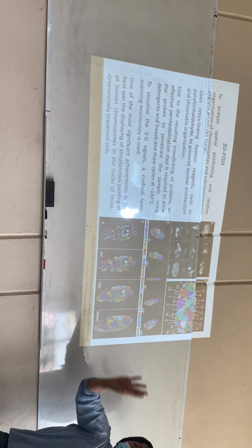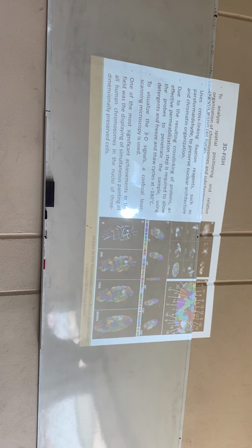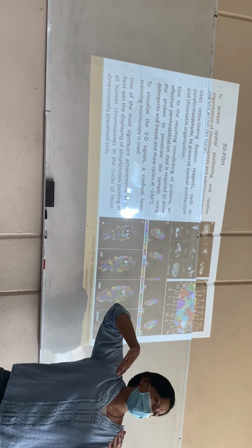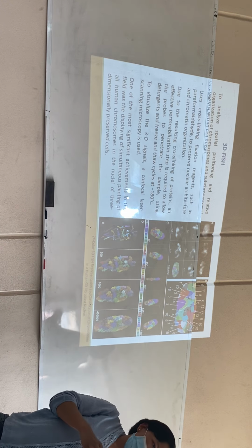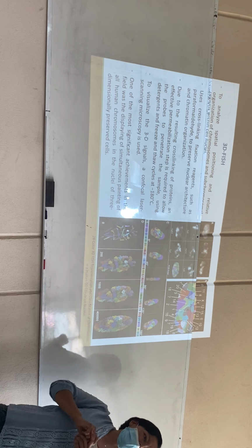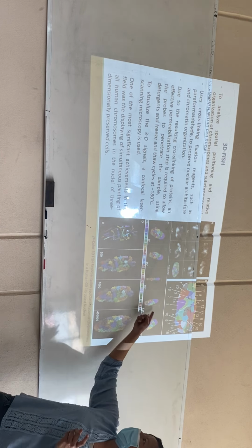And if we move, this is basically only a picture that is utilizing a specialized, very powerful software that is going to allow us to move the image in 3 dimensions. So basically, the only interesting or novel part of this method is the use of a specialized software that is going to allow us to capture the images and to convert them into 3-dimensional images, as you are observing here. So you can turn around the different structures, and you can see and visualize in different types of models.